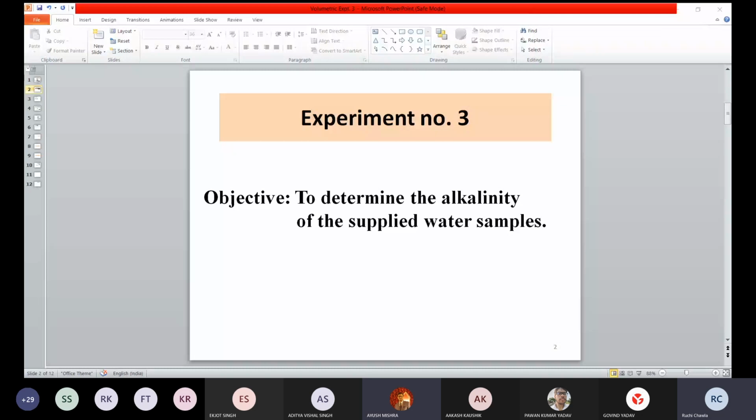What is the difference between distilled water and deionized water? Ma'am, distilled water is obtained by evaporating the water and then cooling it, thereby getting the pure water. By distillation, yes, this is a distillation process, but you are not giving the answer correctly. You are evaporating water, then you are condensing what? The water vapors. Yes, the water vapors. You did not use this term while answering. Be very specific and clear about what you are saying in your answers. Okay, so go again.